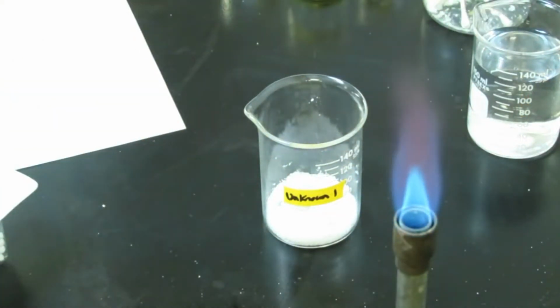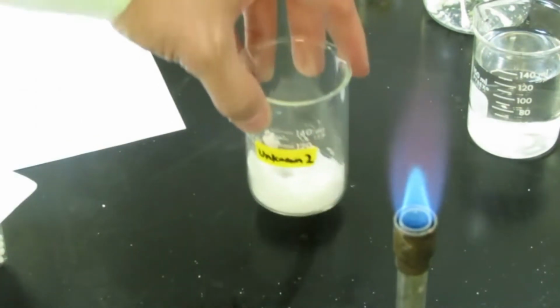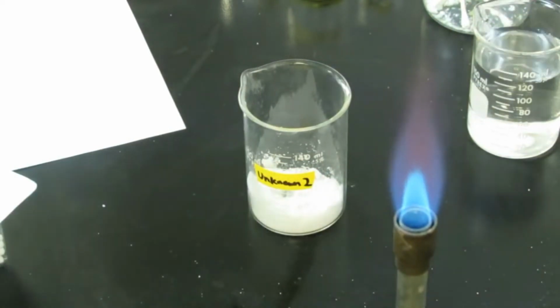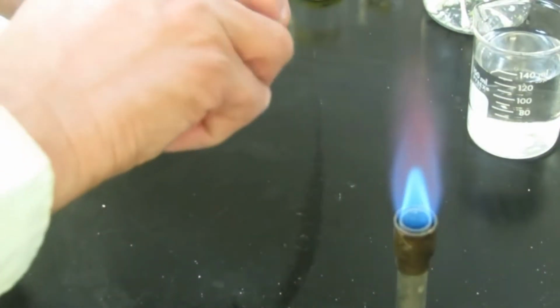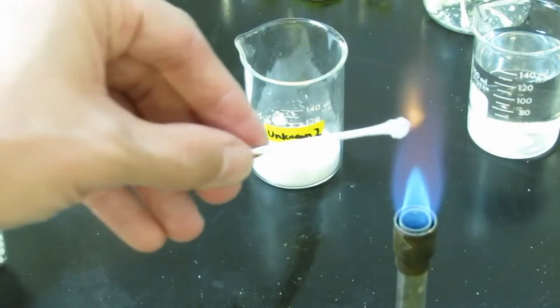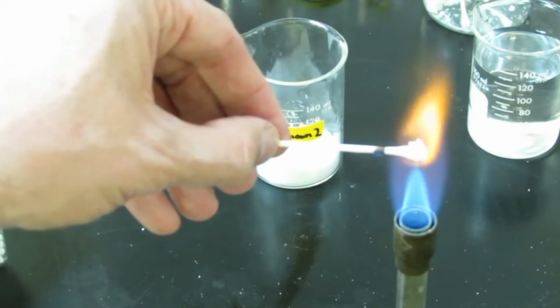Okay. And then we'll put that off to the side. And this is our unknown number 2. We'll handle that the same way. We'll get our Q-tip moistened and get that nice and coated with our unknown number 2. And that's unknown number 2's flame test color.